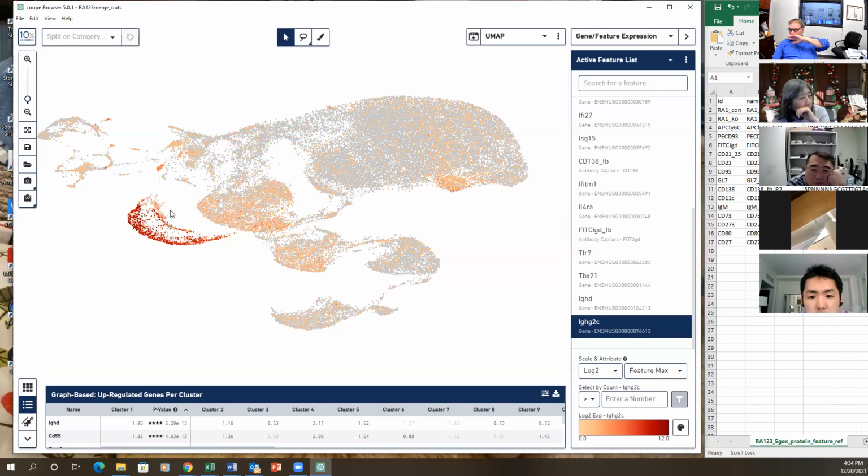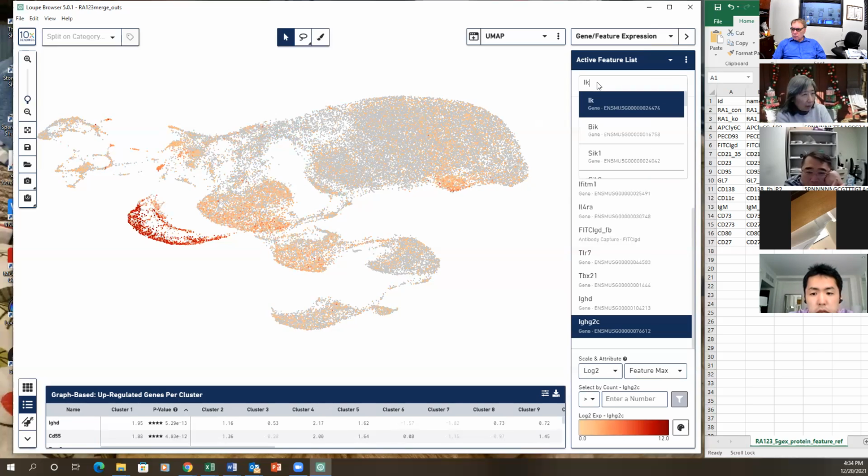So plasma cell, but look at this. This population is making it as well. So it's an alternative route of making antibody. It is true. It's not germinal center. So how about Icarus? Icarus, yeah, it should be.